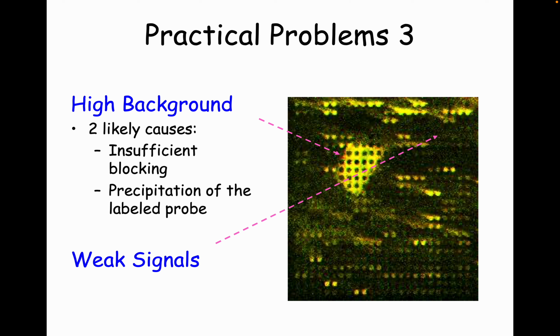Okay, areas of high background, absolutely. If you're using antibodies for this or anything, even a Western blot, the thing to watch is that antibodies are sticky molecules. And they can stick even in places where they're not supposed to stick, because you're putting them on these weird metal and plastic and protein arrays with very limited amounts of water present at some times. And yeah, it's just not very physiological.